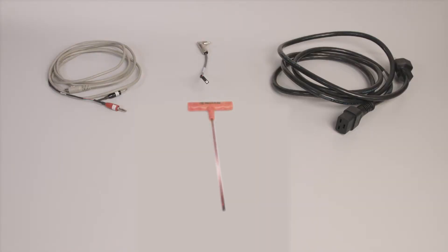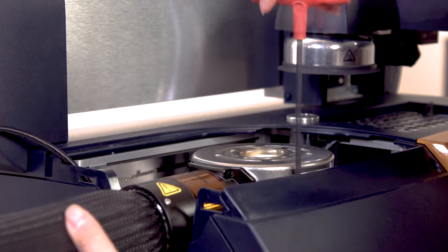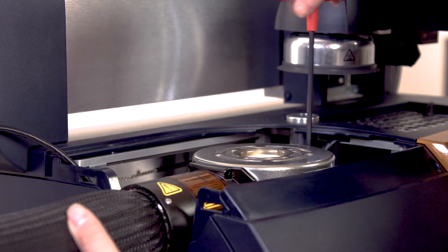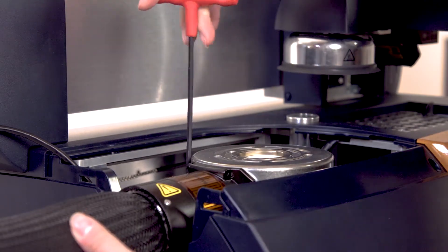Use the 5/32-inch Allen wrench to tighten the screws. Partially tighten the three screws alternating around the cooling head, partially tightening each screw to ensure an even and tight fit.